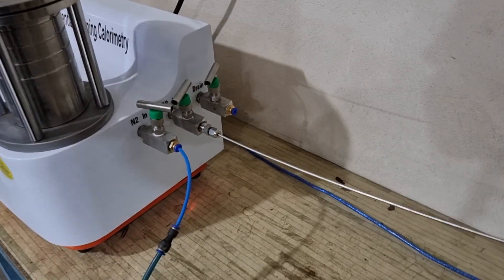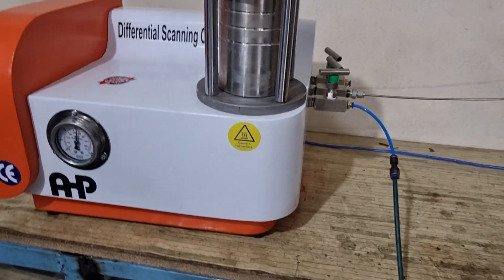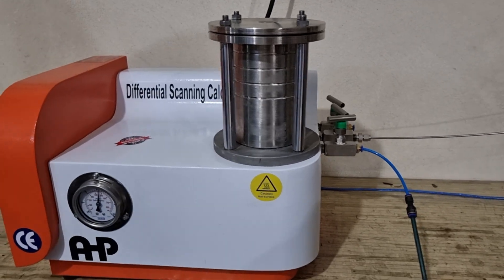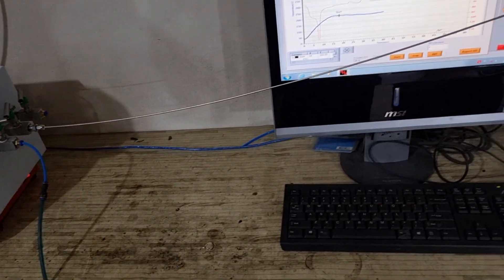The machine features a manual drain, nitrogen and oxygen inlet valves, needle valves, and solenoid valves inside. The key difference from the basic machine is that the test is conducted at high pressure.